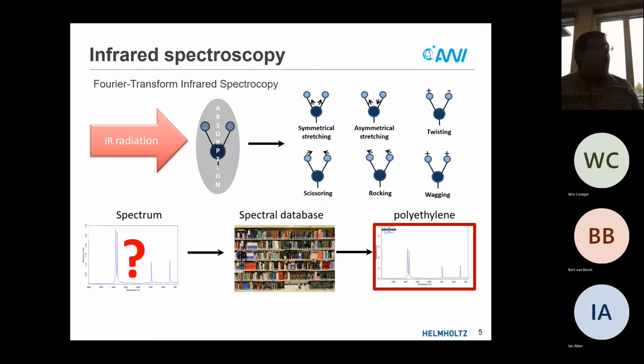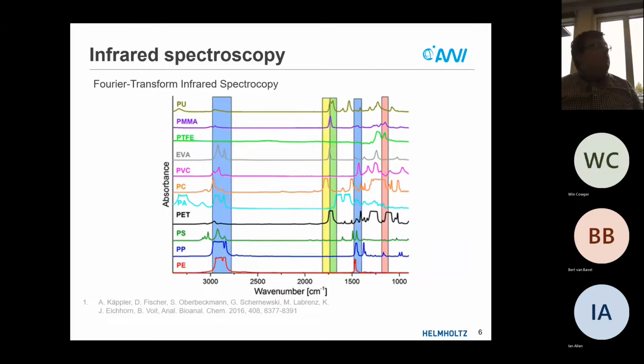For this example, it had been polyethylene. So most of the polymers have a really nice own fingerprint, so we can use that to identify them. Initial approach was to produce a check for these peak regions, but as developed, we moved even further on.